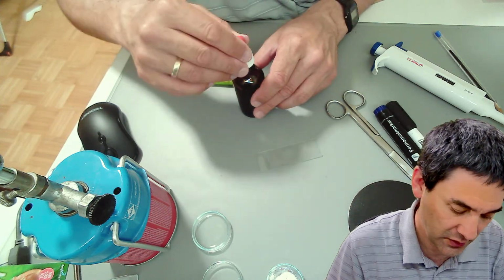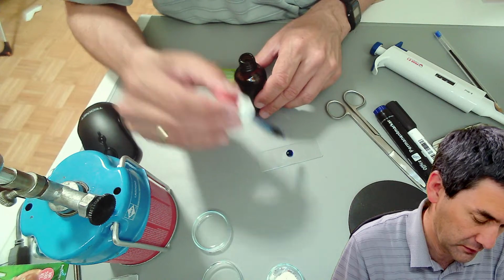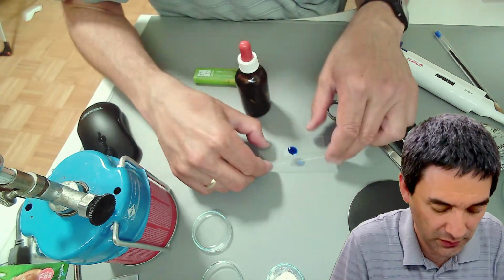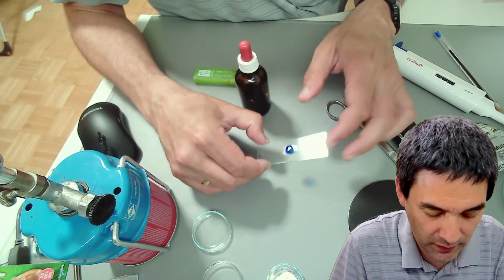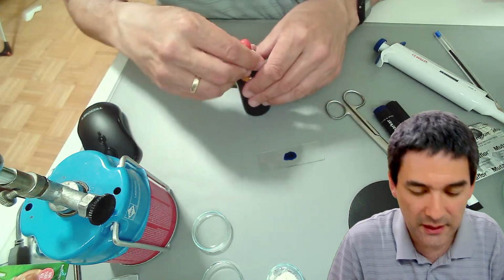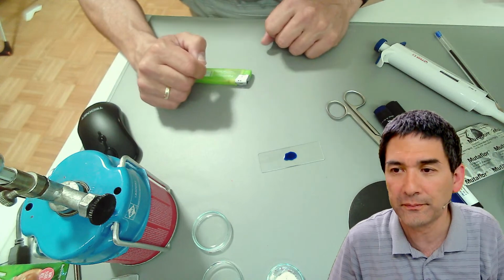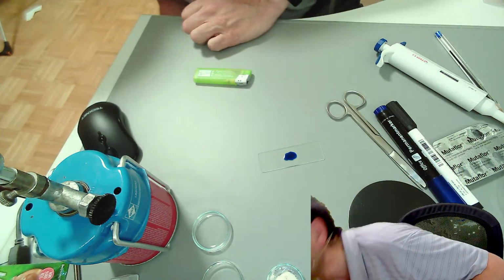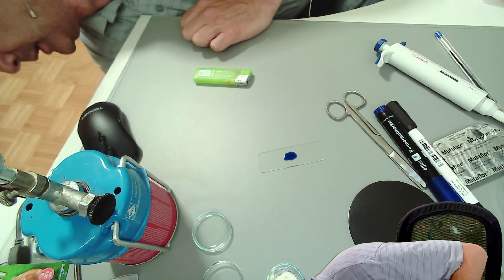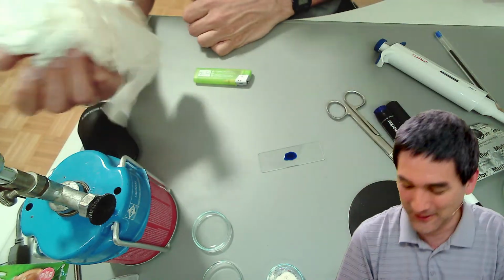Okay, so I'm going to simply add a drop here. And I'm going to allow it to stain, maybe a minute or two. It takes some time for the stain to be absorbed into the cells. And I need some paper. Oh my gosh. I need to maybe pull out a little bit of tissue paper from the trash can. Here we go.